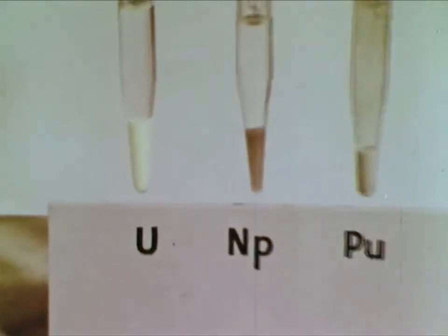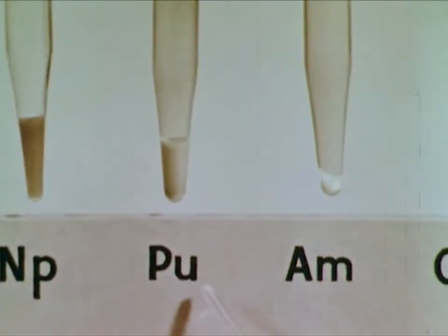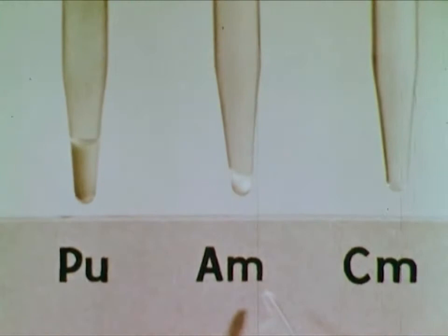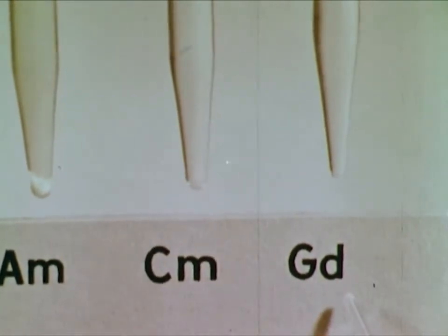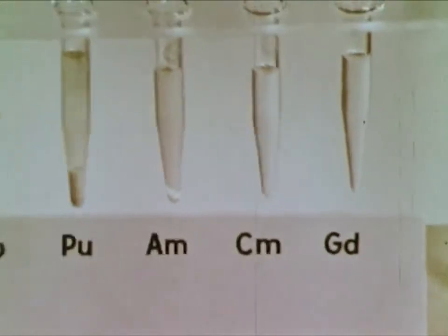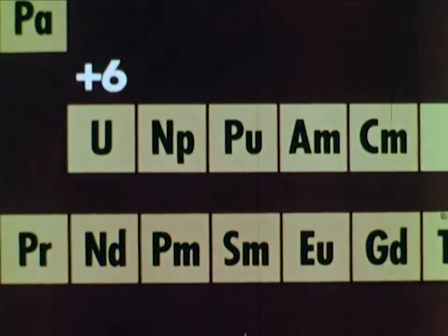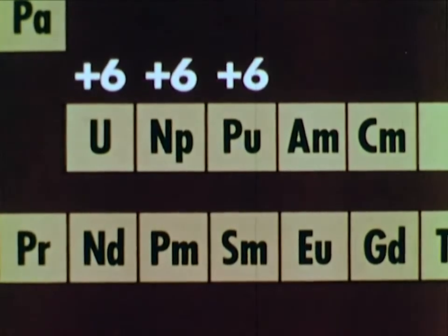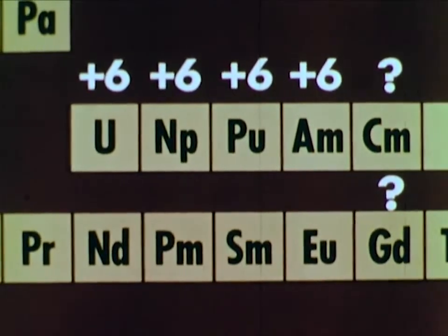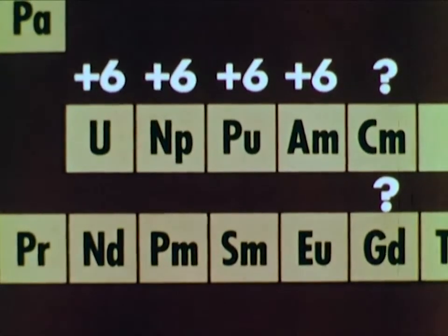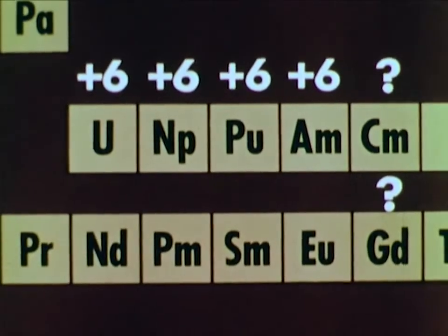Here are the results, half an hour later. Precipitates are present in uranium, neptunium, plutonium, and americium, indicating the presence of plus-six ions. But no precipitates appear in the curium or gadolinium solutions. Apparently, they cannot be oxidized to the plus-six state. Our tests show that uranium, neptunium, plutonium, and americium all oxidize to a plus-six state. But curium and gadolinium do not form a plus-six ion. Perhaps they were oxidized to a plus-five or plus-four state, or perhaps neither of them was oxidized beyond the plus-three state in which it started.